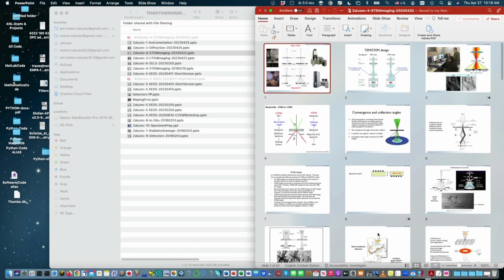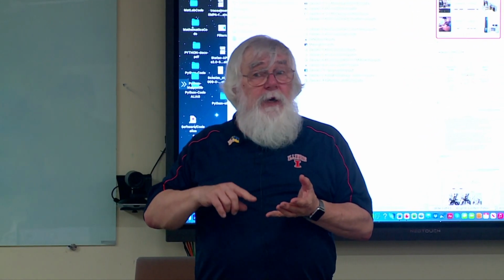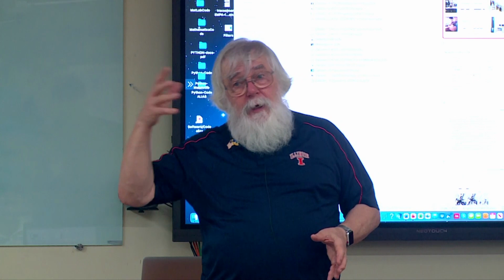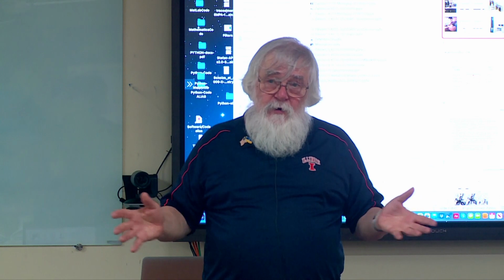So what did we talk about today? Just now, we talked about a TEM image. We talked about the type of contrast you get from a TEM image. You either have amplitude contrast, diffraction contrast, or phase contrast. If you're doing high-resolution imaging, you're doing phase contrast. In phase contrast, you have to worry about a lot of things: the thickness of the sample, the focus of the sample, the aberration coefficients of the microscope. In amplitude contrast, it's a lot simpler because we're putting an aperture around, blocking away diffracted beams, and we get dark and bright areas. Those dark and bright areas have to do with how the beams are diffracted and how you set up the diffracting conditions.